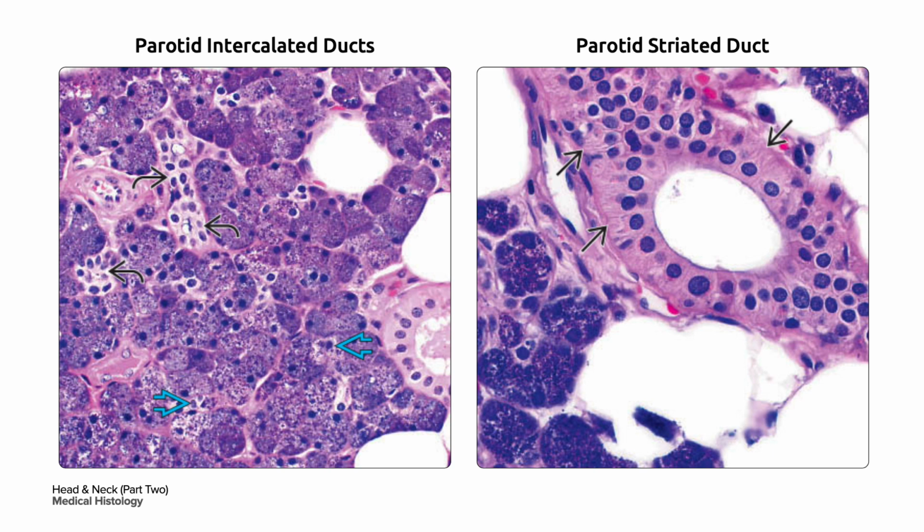On your right are striated ducts, which are simple columnar intralobular ducts that consist of cells with abundant eosinophilic cytoplasm and round central nuclei. Invaginations of the basal cell membrane in the single black arrow account for the striation seen in histologic sections. These cells have numerous mitochondria, which cause the cytoplasmic eosinophilia.